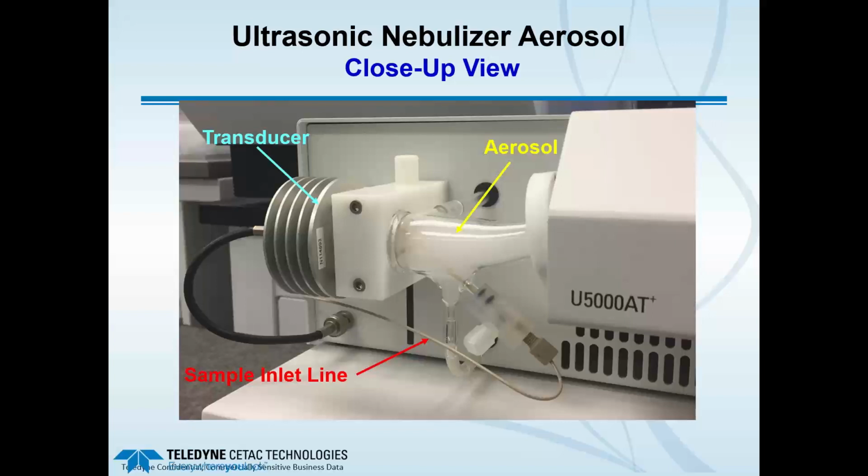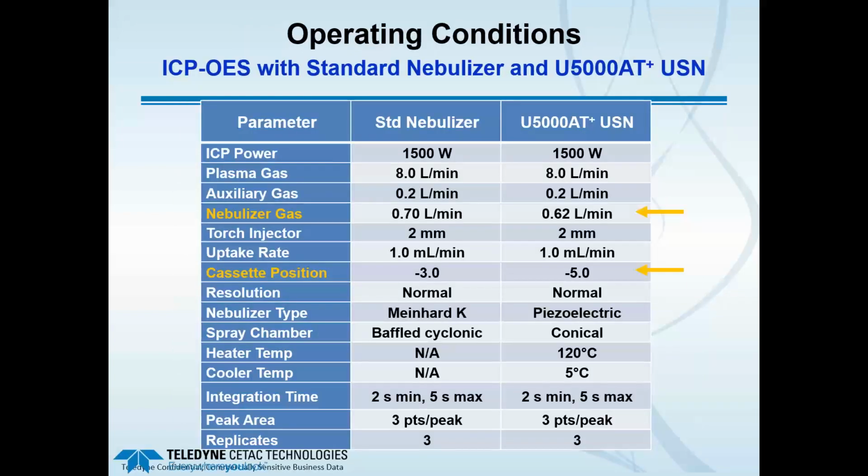So I know this table is a little bit busy. I did want to show the operating conditions between the standard nebulizer and the ultrasonic nebulizer in these tests. And I pointed out in the color orange the two things, and the only two things that were changed.